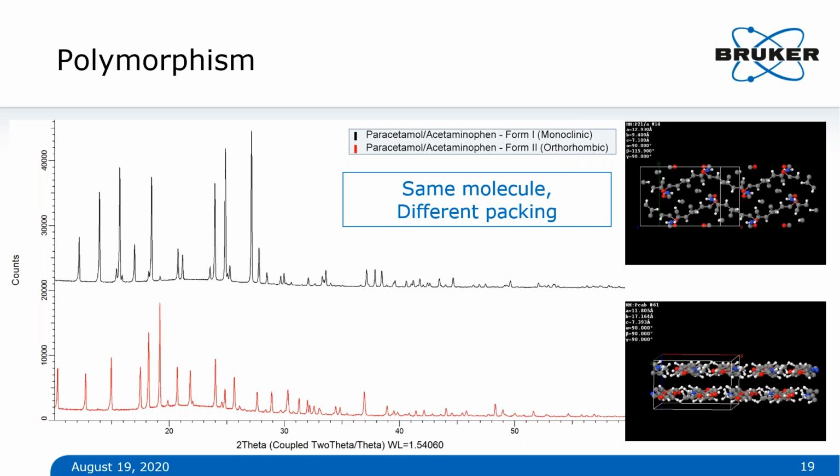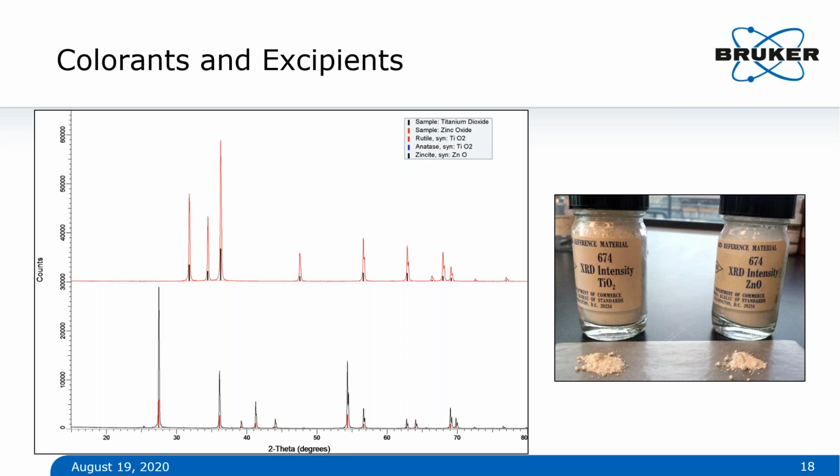So good data, I would look at the scans here shown and say, that's pretty good data. You want to have nice, sharp, skinny peaks, good signal in the background, good signal to noise. You don't want to see a lot of visible wobble in the background. Here we can see, depending on how big of a monitor you're looking at, you can see the noise there. Something like this has even less noise, so this would be an exceptional quality scan.